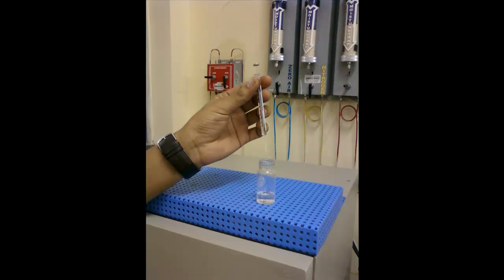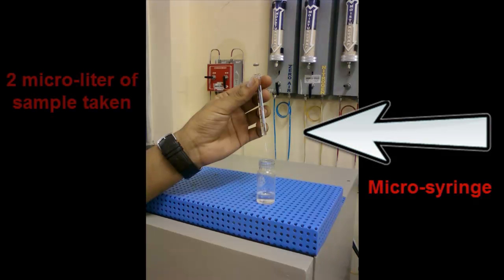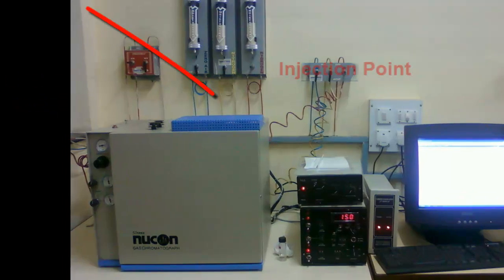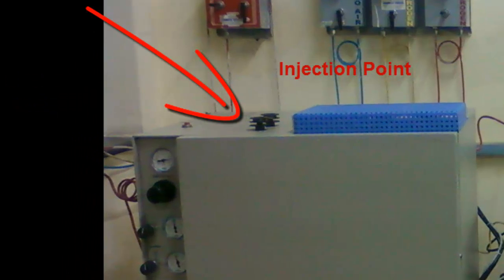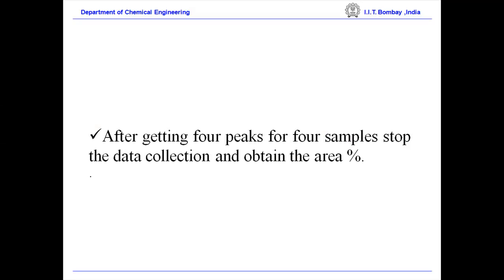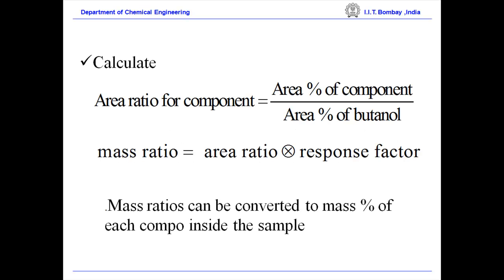Having made the above checks, we now inject 2 microliter of sample into the injector with the help of a micro syringe. Simultaneously start the data collection by pushing the red button. After getting 4 peaks for 4 samples, stop the data collection and obtain the area percentage.